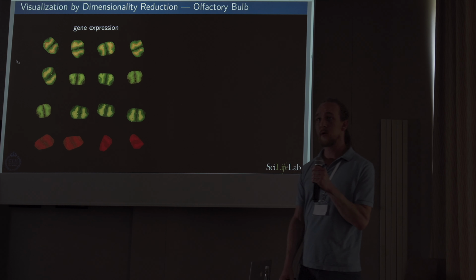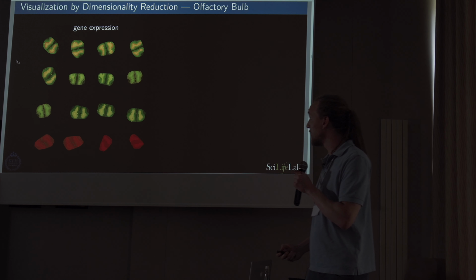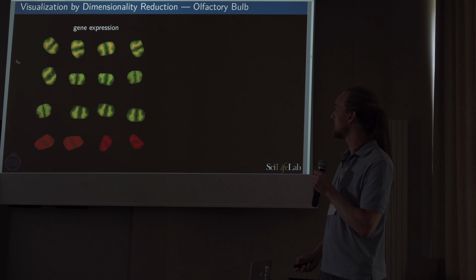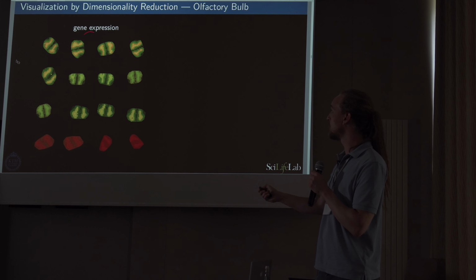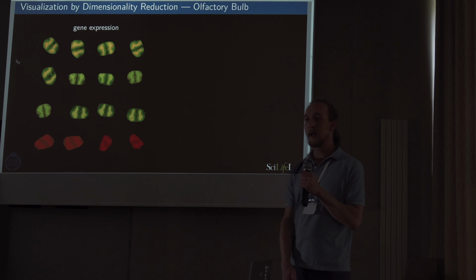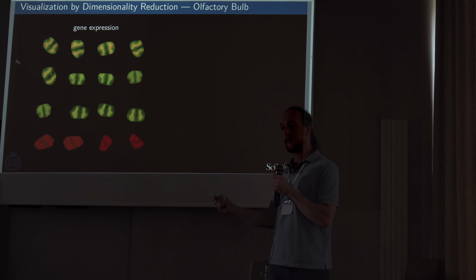Yeah, so I wanted to come to speak about batch effects, and they become obvious as you look at multiple samples. In this case, we have 16 olfactory bulb samples from, I think, about 7 individuals, and I can point out that the first individual had 4 sections. The second had 1, the third had 2, the fourth has these 2, and there's a triple, and this is 1, and finally this is another one. I can also say that the last 4 experiments were done months after the first one.